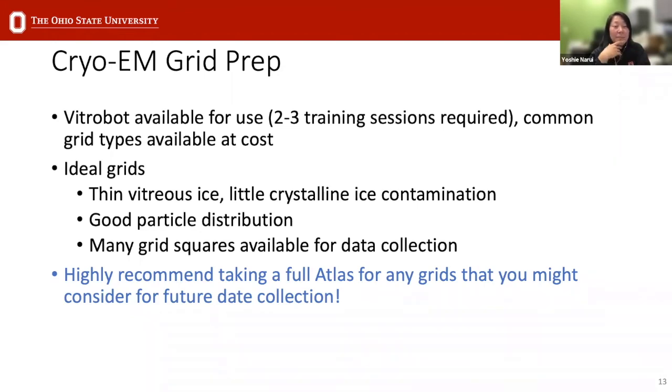And as instrument managers, we highly recommend taking what's called an atlas for any grids that you think are promising and that you might consider using for data collection. Okay, so I'll show you on the next slide. Let me just show you what I'm talking about.